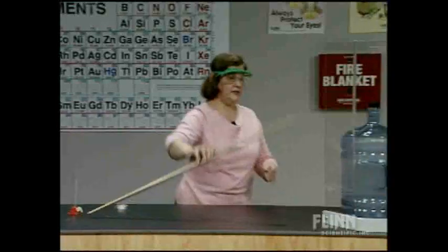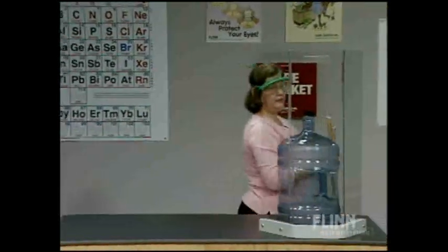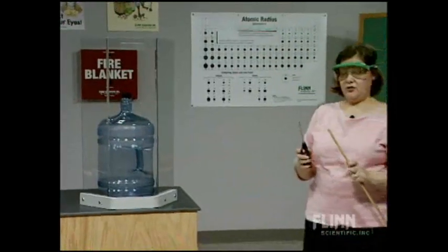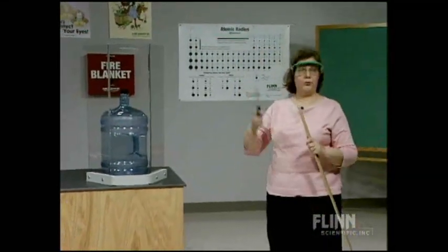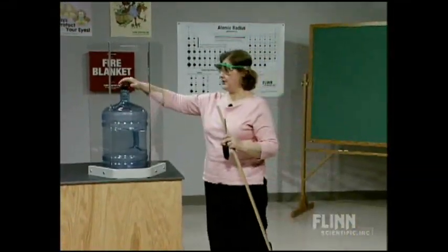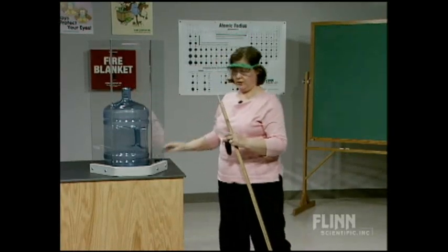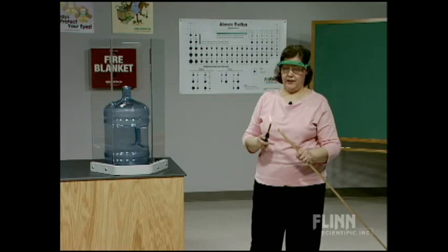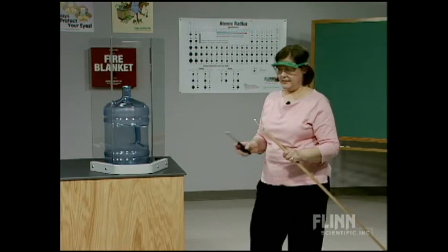What I'm going to do is light a splint and then ignite the vapor in there. I'm going to light my splint, then bring the lights down. First, I'm going to take this off for just a moment, go ahead and light my splint so I can see what I'm doing, and then take the lights down. On the count of three, I'm going to stand on the right side of the shield as well. One, two, three.